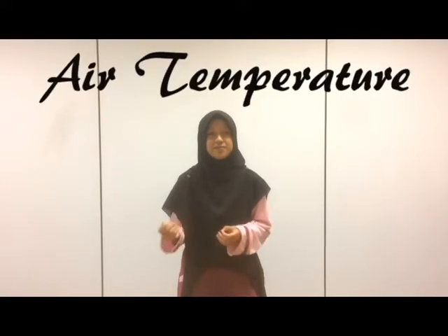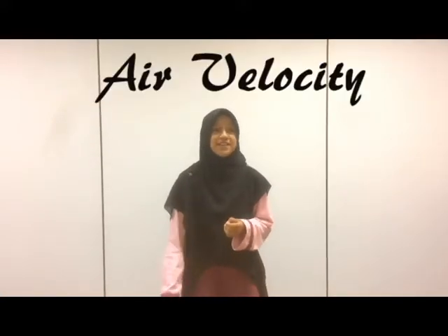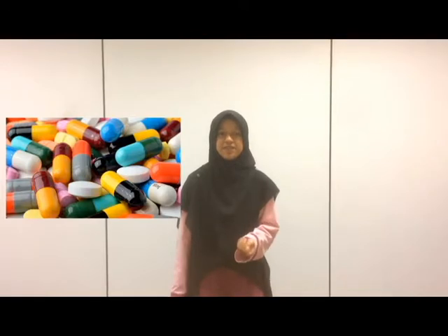Process, drying process, we use the tray dryer. Basically, drying is a process of removing water from wet substances to an unsaturated gas phase. For the drying process, there are two variables that affect it: number one is the air temperature and number two is the air velocity. The drying process has many applications in industry, such as the pharmaceutical industry, food industry, and also agriculture industry.